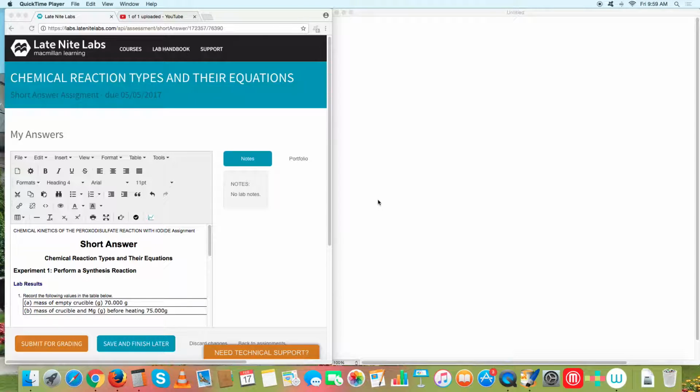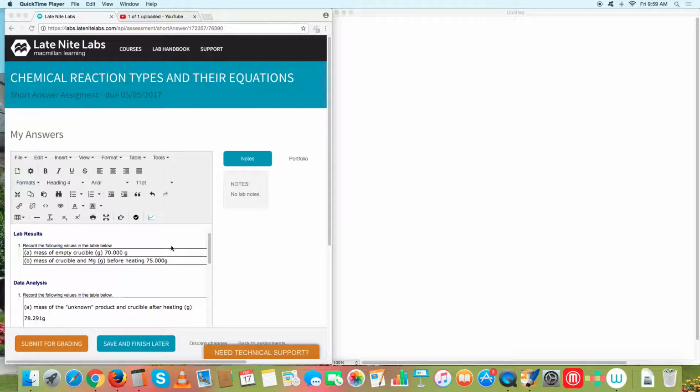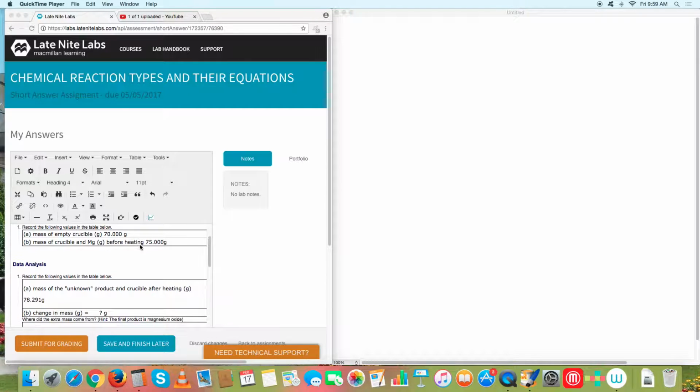The purpose of this video is to give you some help with the chemical reaction types and their equations lab write-up. What I've done here is put in some fake data. This is data that's not going to be what you got in the lab, but it's there to help you figure out what to do with your data. So let's take a look at the first one. This is for the one with the magnesium.